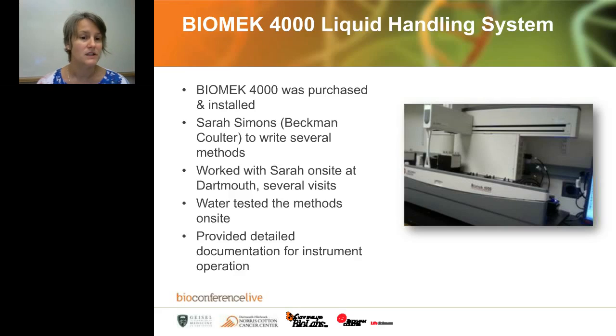Sarah helped us water test all the methods before she left us with the instrument, and so we were very capable of running the instrument fairly quickly after the methods were installed. And another nice thing that Beckman did for us was they created a Word document which provided detailed explanations of exactly how we were to run the protocol, what was needed at which steps, so that it made it easy for us to use.